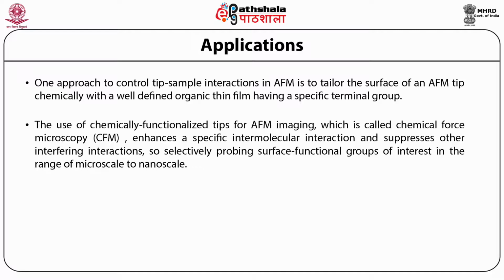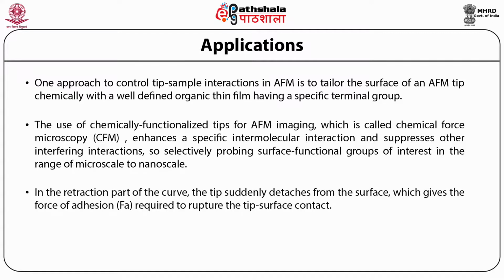In the measurements, the deflection of the cantilever, which can be converted to tip-surface force, is recorded at a single point on the sample during an approach and withdrawal cycle at a given speed. In the retraction part of the curve, the tip suddenly detaches from the surface, which gives the force of adhesion required to rupture the tip-surface contact.